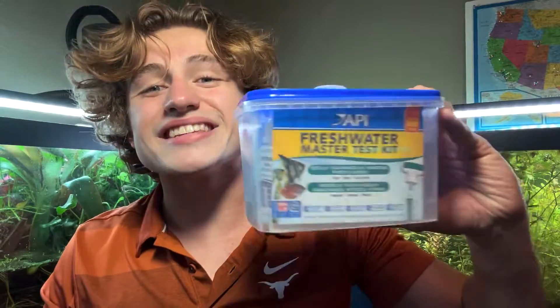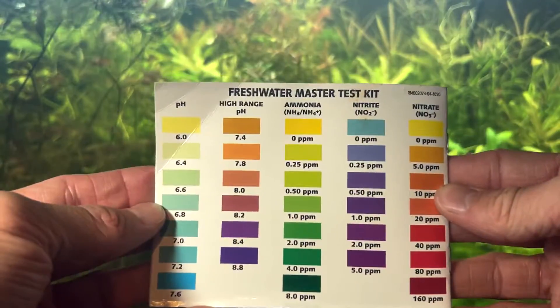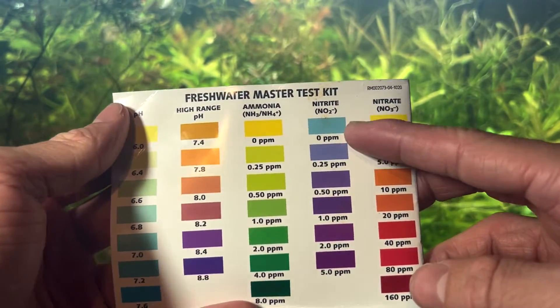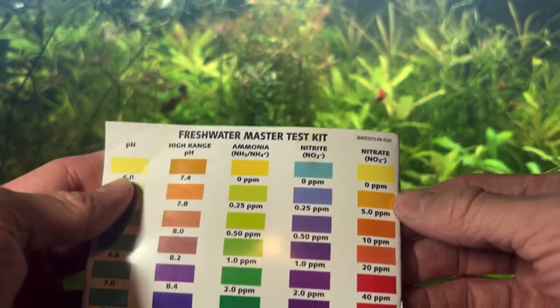Once you're done using your test tubes, be sure to wash them off with water and dry them out completely before putting them back with their lids on. To determine if your aquarium is cycled: you'll want zero ppm of ammonia, zero ppm of nitrite, and anywhere from zero to 20 ppm of nitrate.